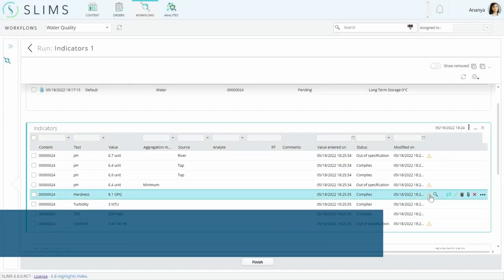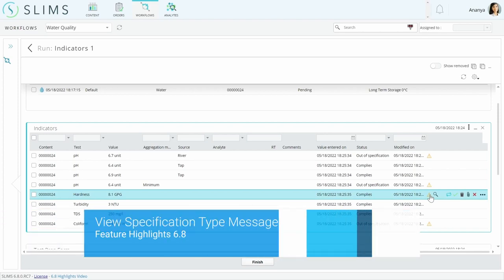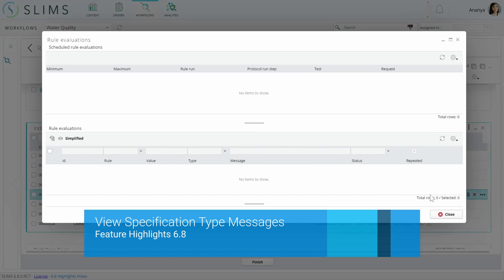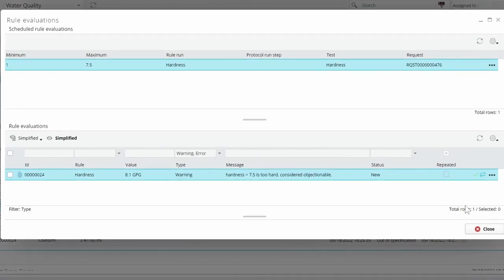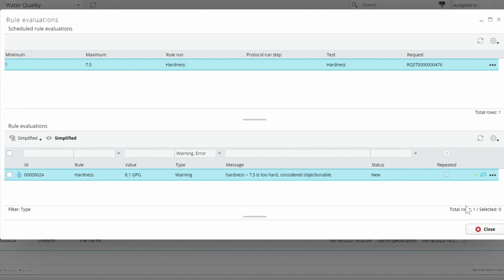There are some custom messages added to rule evaluations when you use specification types. You can choose a feedback type, warning or error, and design the text that's provided when the result is within specification, too high, too low, or not expected. Then a specification can use any of the created specification types.